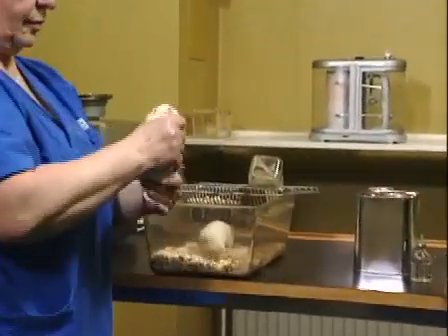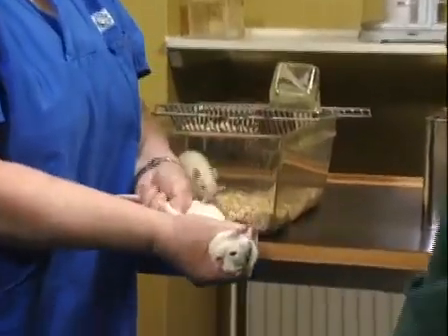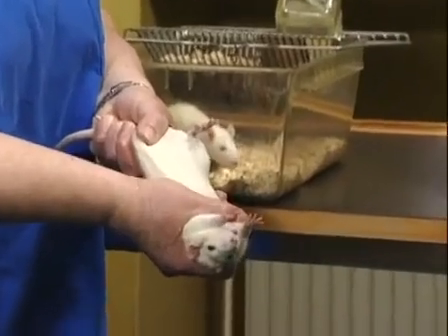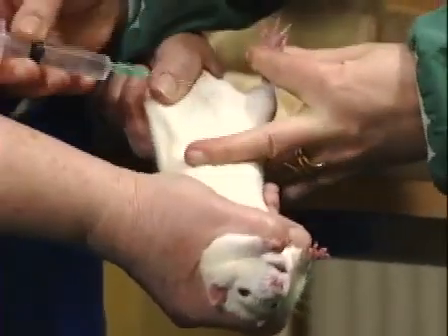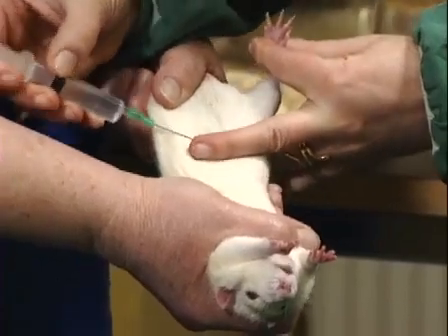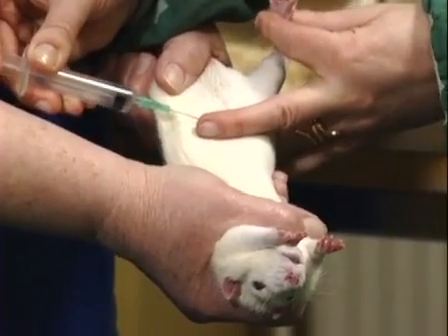Any solution which is injected intraperitoneally, provided that its volume is not diminutive, should affect all the cells in the test tissue, especially as the mesothelial layer of cells that covers the extremely thin mesenteric window is highly permeable to solutes. As no surgery is involved, the angiogenesis to be studied in the mesenteric window is not affected by wound healing-induced angiogenesis.